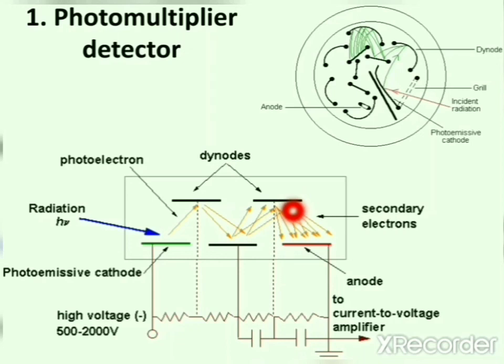At last, these multiplied electrons are collected by the collector electrode, and the signal produced by these electrons is the fingerprint of analysis of the sample under investigation. Photomultipliers are extremely sensitive to light and are best suited when weaker or low radiation is received. Because of the multiplication process, they increase the signal strength.